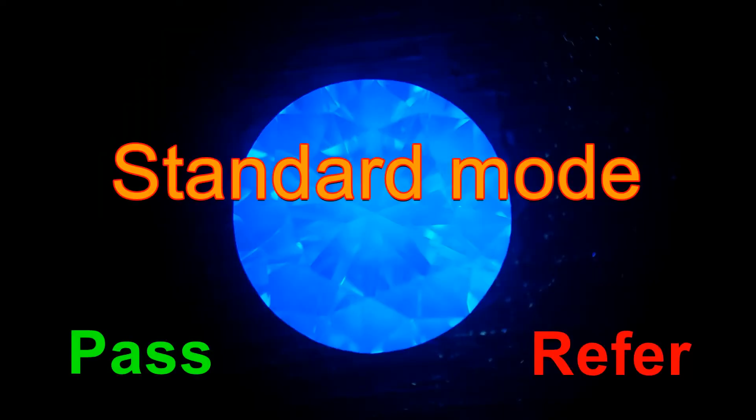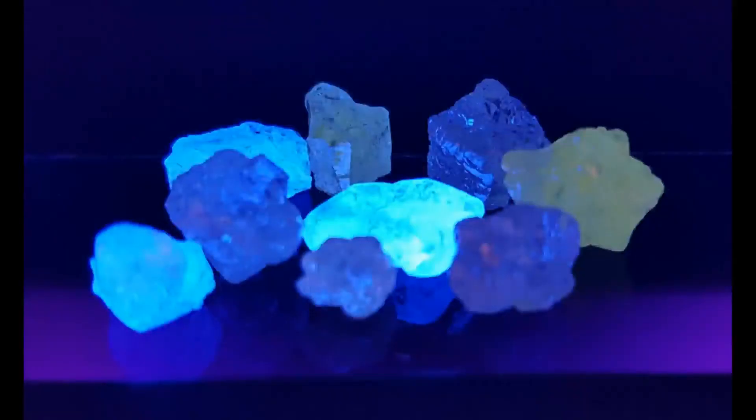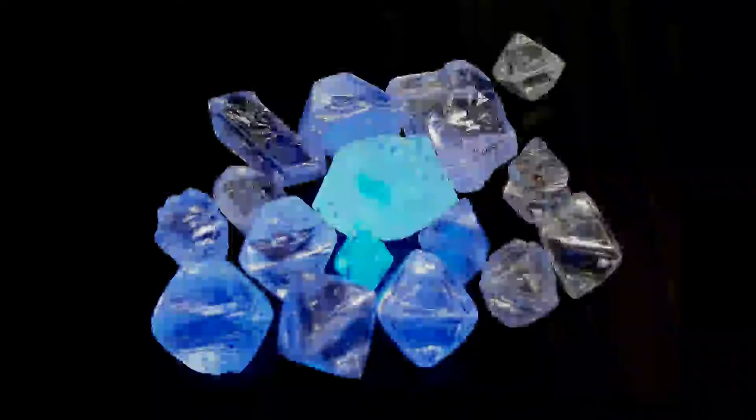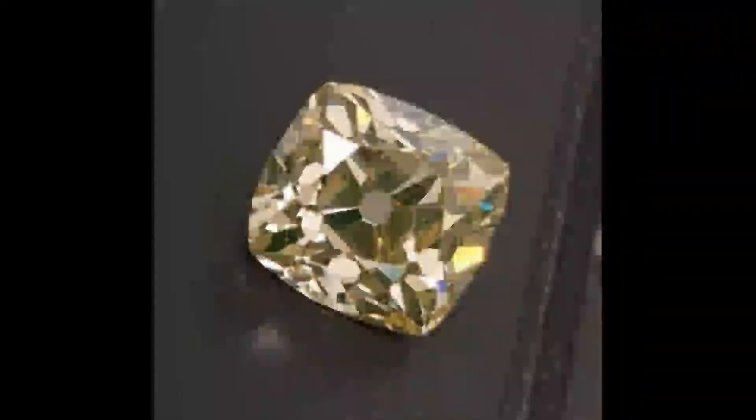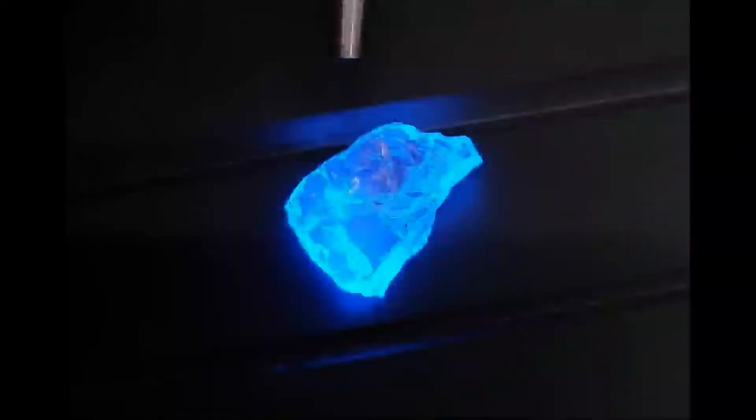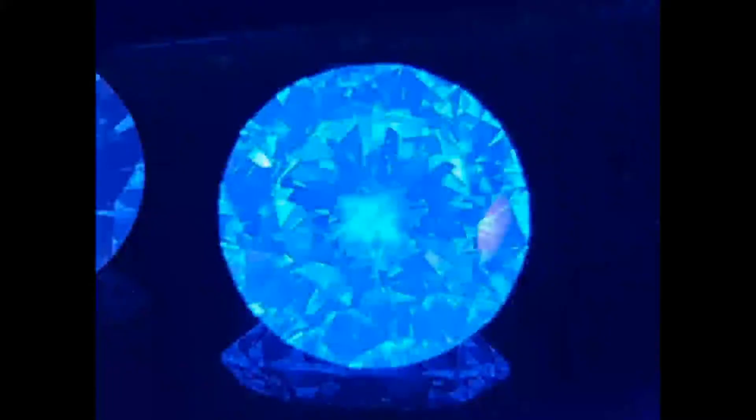Around 98% of natural diamonds embed a specific defect in the crystal lattice, which cannot be reproduced in the synthetic colorless diamond's manufacturing process. This defect, a nitrogen aggregate named N3, is responsible for the blue fluorescence and produces distinctive peaks and related sidebands in the spectrum which are identified by the EXA. The standard mode will pass or refer the diamond depending on the detection of the N3 peak and its sidebands.